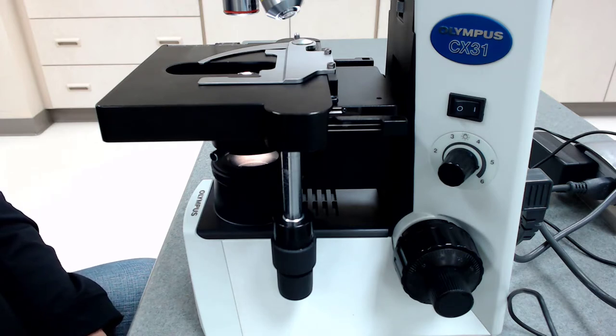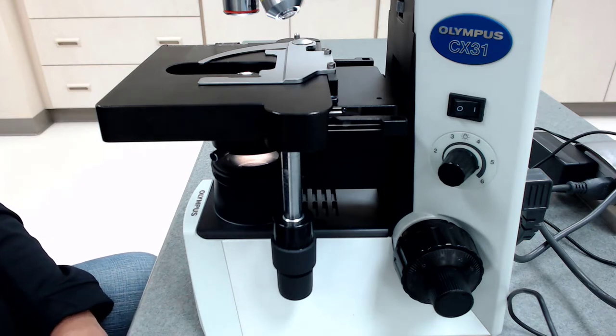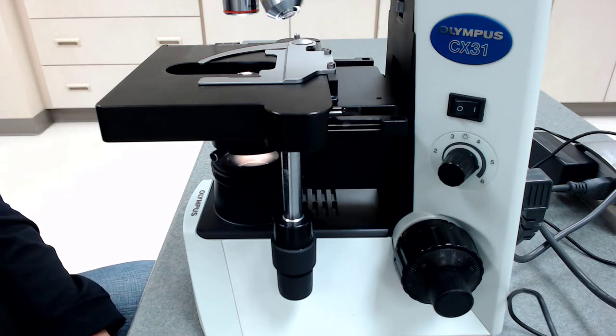So a binocular parfocal compound light microscope. So traditionally, simple microscopes or early microscopes had a single lens or even a glass ball that they would use. So like Anthony van Leeuwenhoek would have used a glass ball as his lens system, but he could see things that were somewhere in the neighborhood of 270x magnification. Pretty awesome for the 1600s.